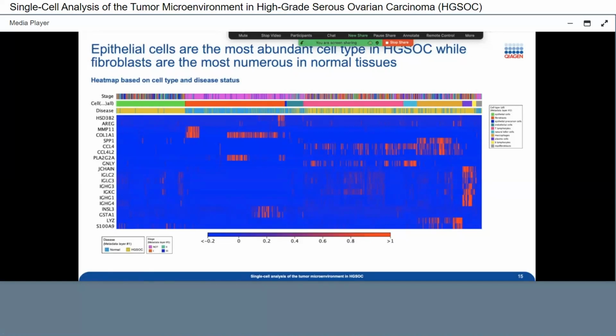A little bit more fibroblast is in place, right? And then you have all the other cell types that are described in that legend here in the color code. So that was one striking element that I've seen, and that confirms, based on the paper as well, regular data of ovarian tissues in aging women.